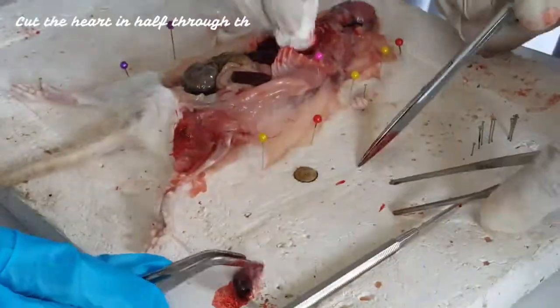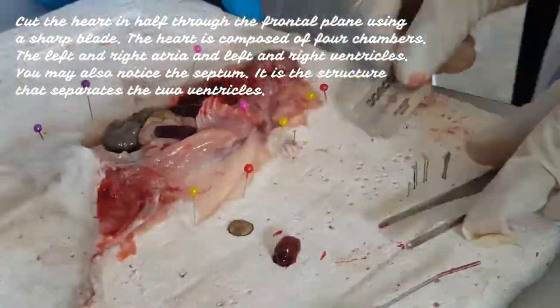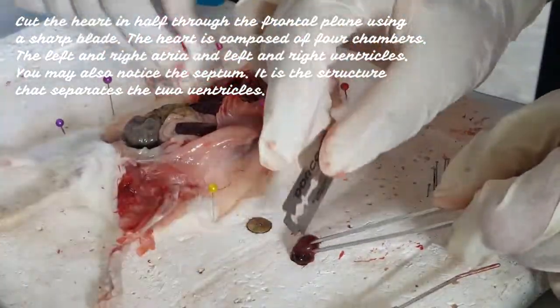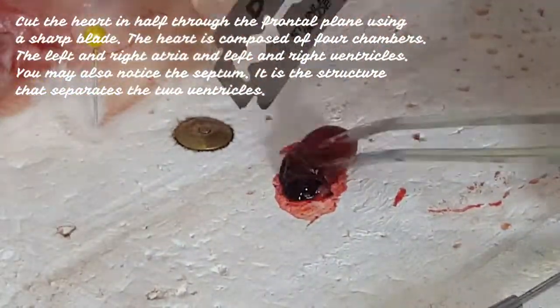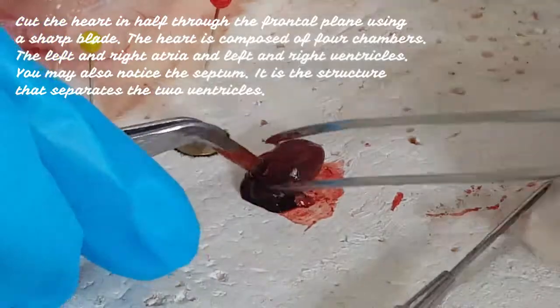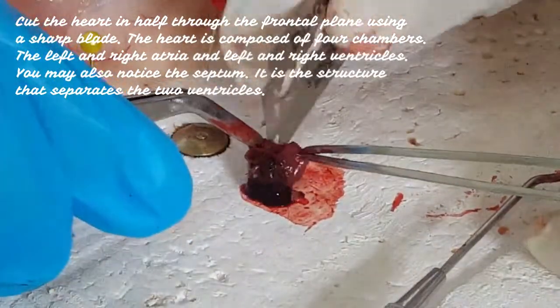Cut the heart in half through the frontal plane using a sharp blade. The heart is composed of four chambers: the left and right atria, and the left and right ventricles. You may also notice the septum, which is a structure that separates the two ventricles.